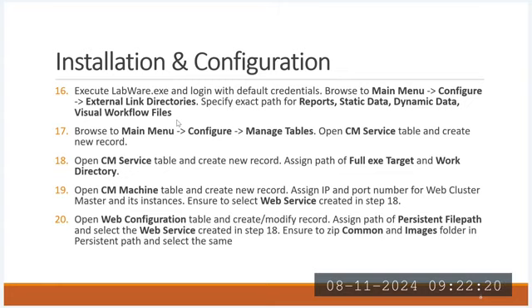Static data is what I prepare as part of my regular tasks, wherever version controls are available. Dynamic data means menu routines, subroutines, and format calculations, wherever you don't have version controls. That is part of your configuration and will be called dynamic data.